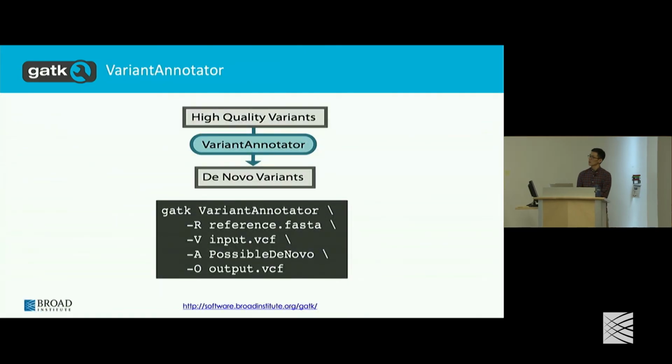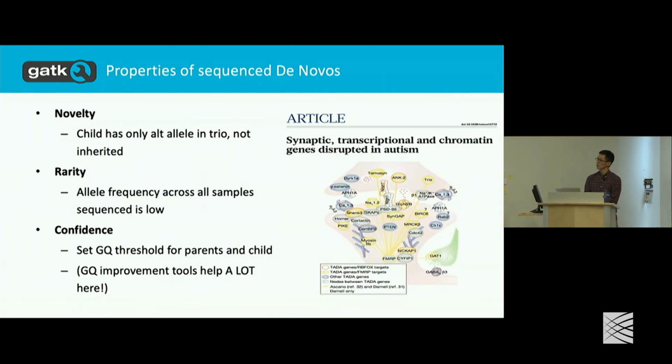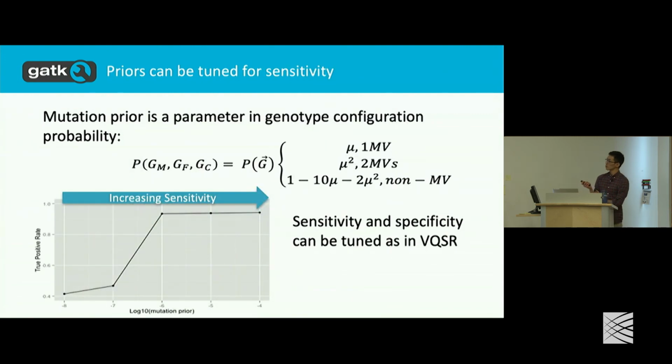All right. Any other questions? Where were we? Yes, the mu value, the 10 to the negative 8 number, is just a suggested default.